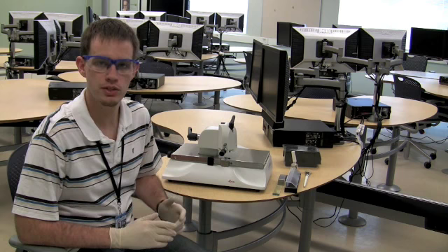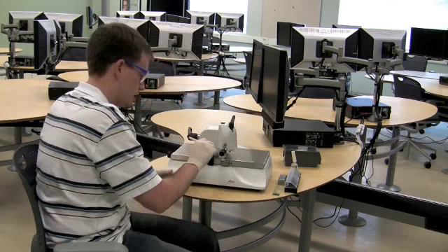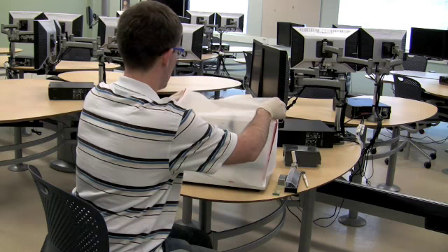When we're done using the machine, it's important to make sure we clean up to get rid of any glass splinters that might have formed from the breaking of the glass. So what we're going to use is just a paintbrush, and we're going to carefully brush off any glass pieces or splinters that might be on the machine. After we finish that, we're ready to close it down. So we'll take the plastic cover for the instrument, and we're going to place it over the instrument to protect it from dust or anything else that might be in the lab.